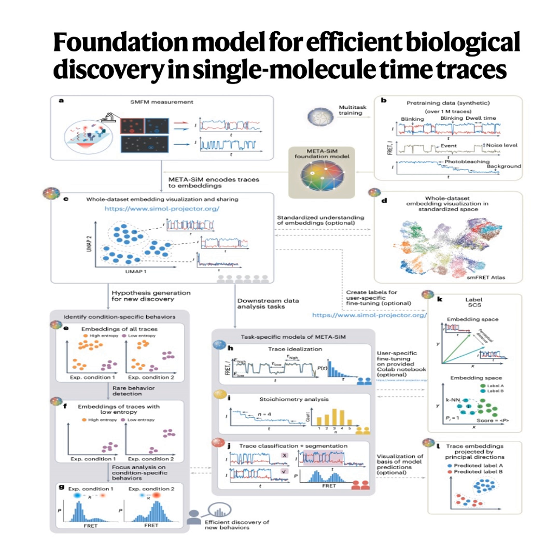And they applied META-SiM and the LSE metric to this incredibly complex data set. What happened? This is where it gets really impressive. The paper reports that users who had no prior specialized knowledge of the intricacies of splicing. Okay, so not splicing experts. Right. They were able, using META-SiM and focusing on the low LSE traces in the projector, to identify a previously unknown intermediate state in the splicing pathway. Wow. A novel state found by non-experts just by following the LSE signal.